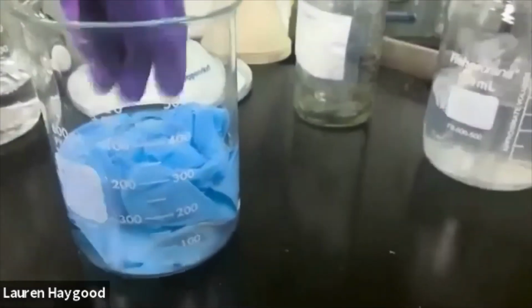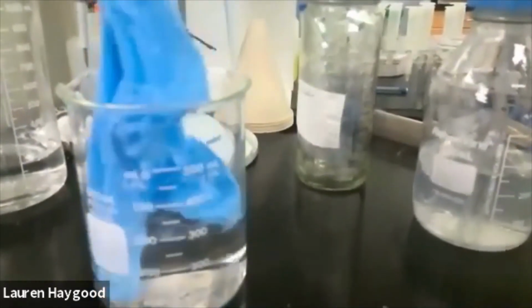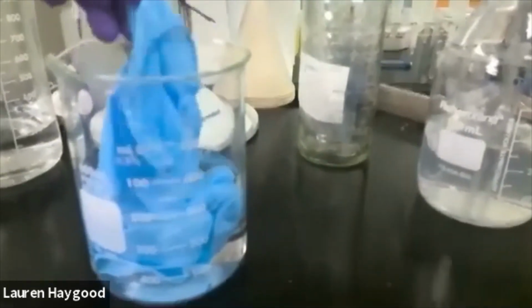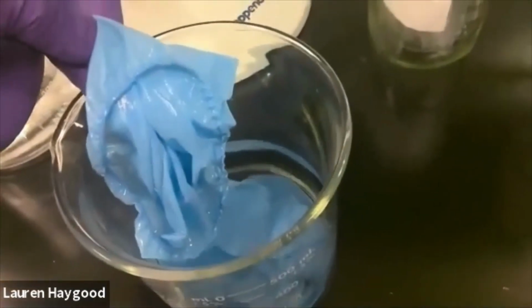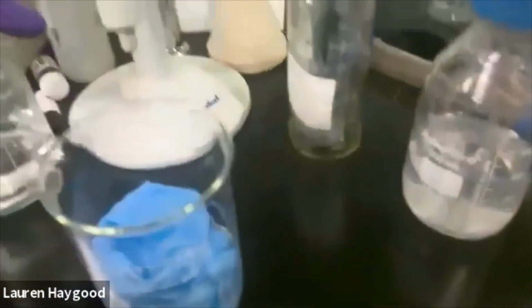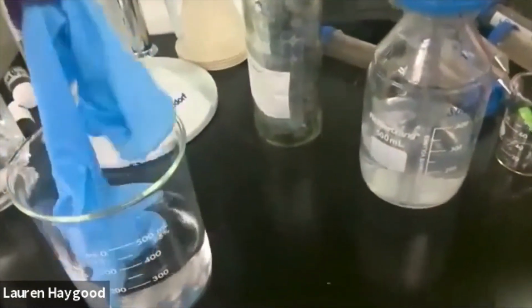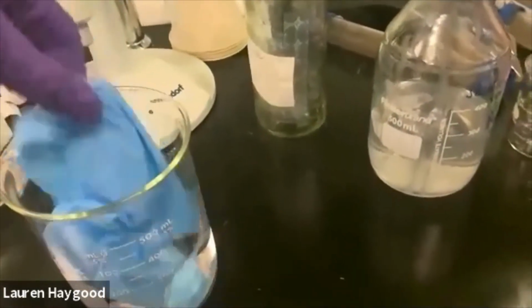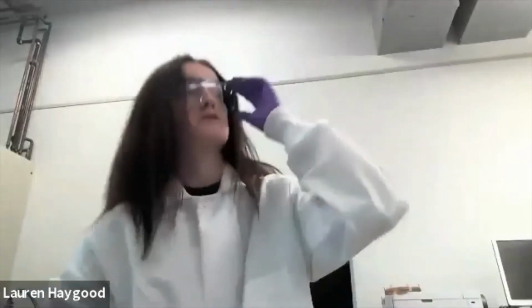So essentially what we're doing in the acetone is we are breaking down this glove, and eventually we would probably be able to break it down all the way. I don't know if you guys can see this, but see how it's kind of going all wrinkly around there? So we are basically breaking down this lab glove and breaking down its components. That is just reason number whatever why chemistry is cool.